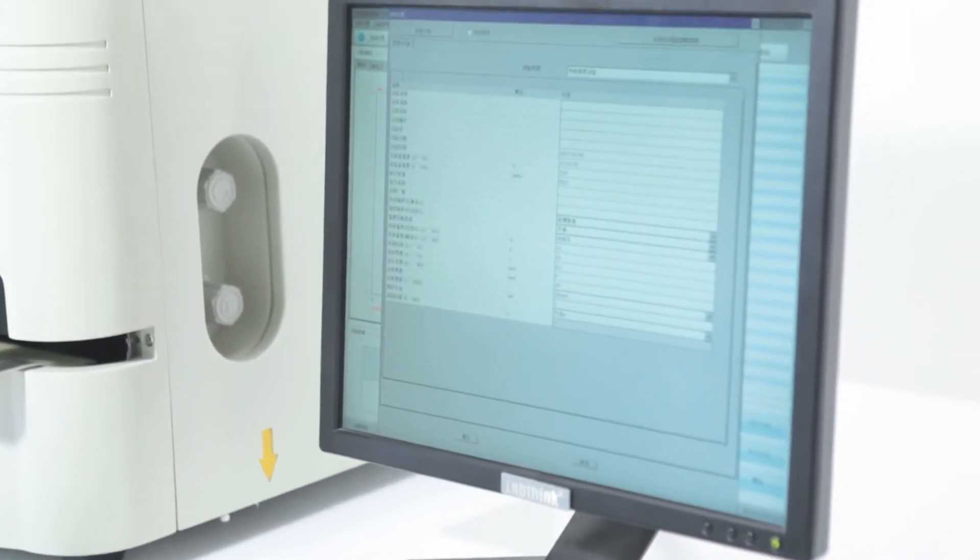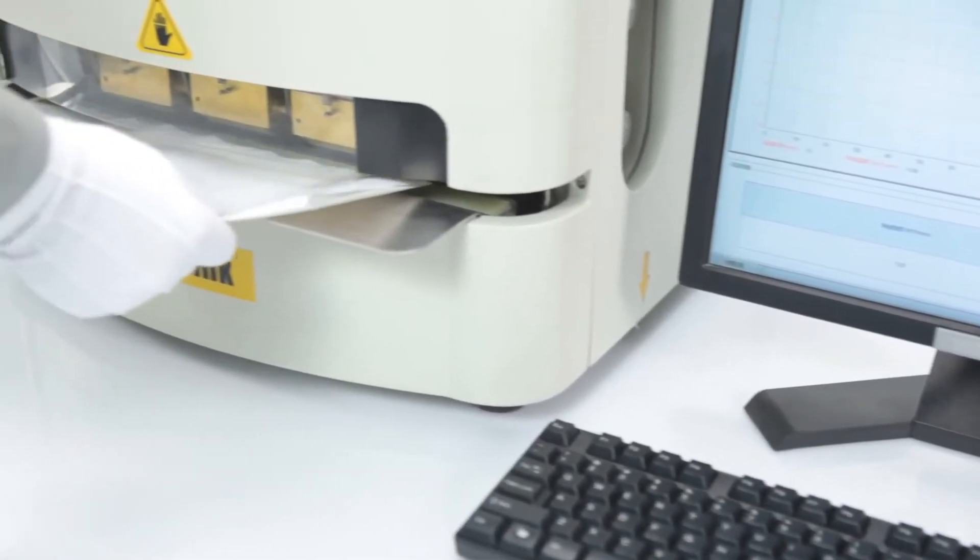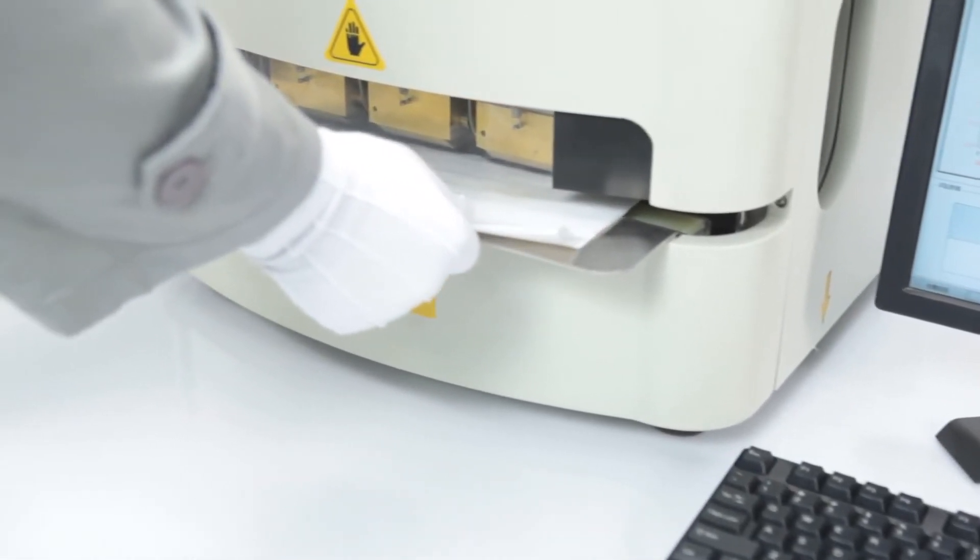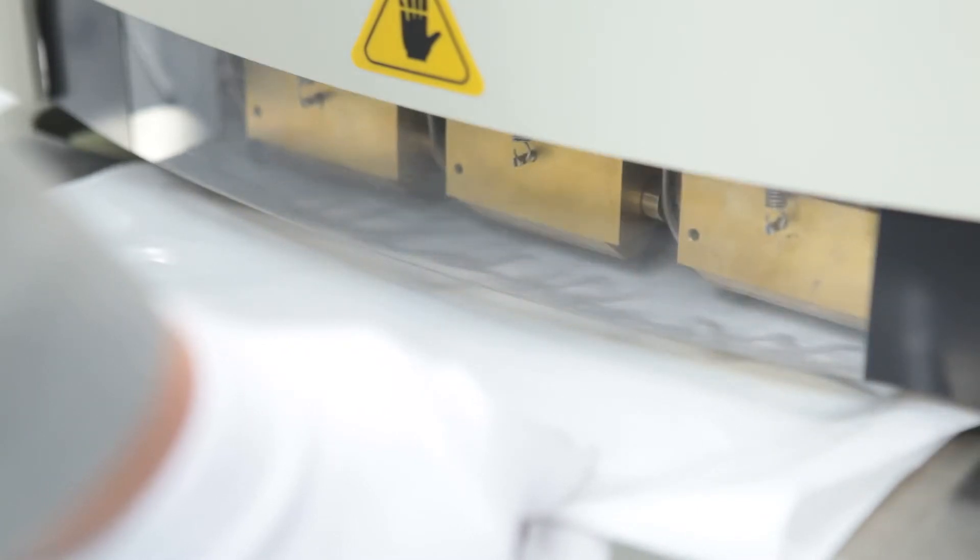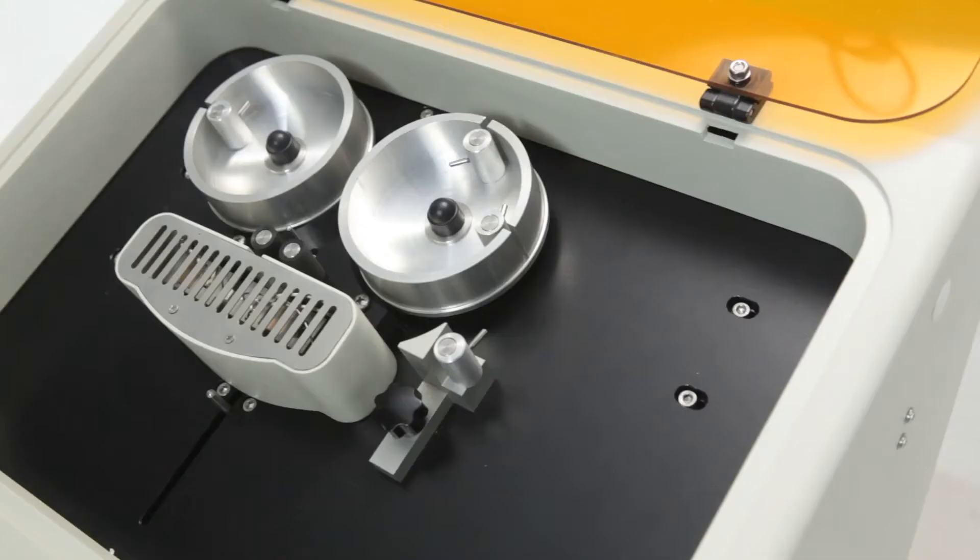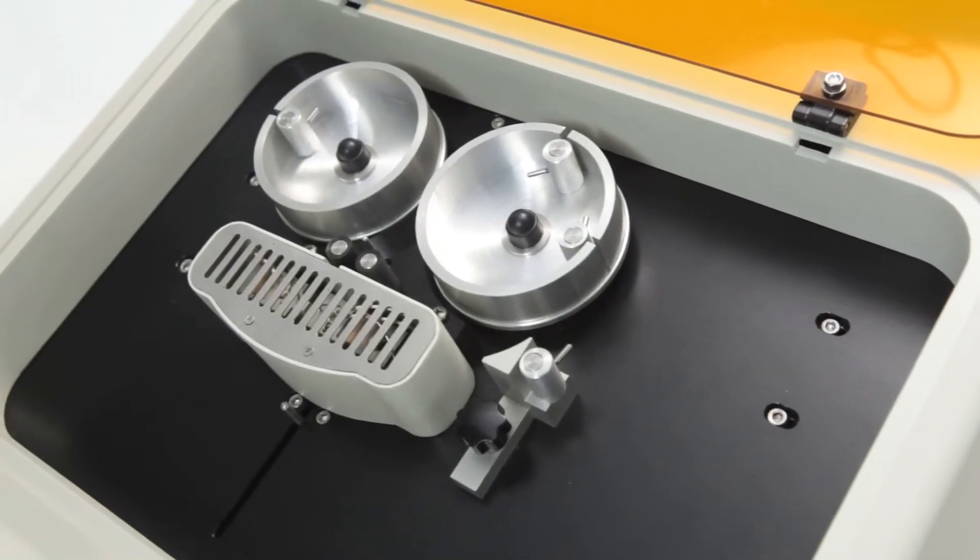By testing the specimen at a certain speed under a certain sealing pressure and at three different sealing temperatures in one single test, the ideal sealing parameter can be determined rapidly and accurately. Moreover, the heat seal strength of the specimens can be measured within 20 seconds.